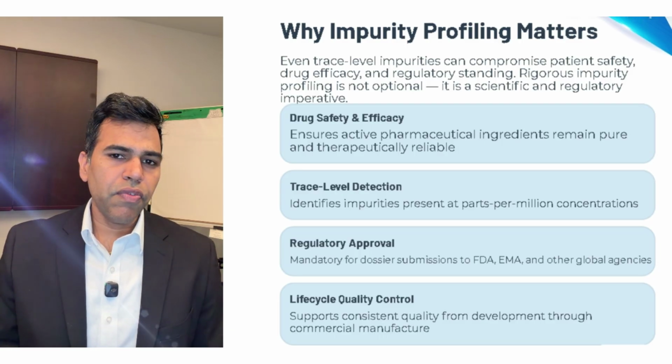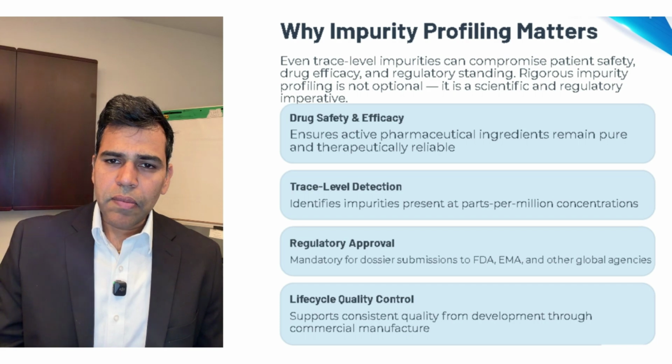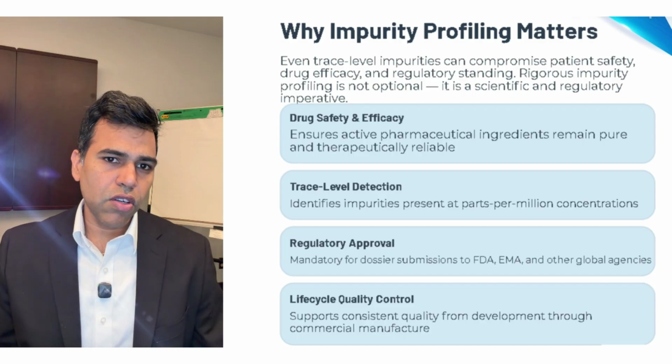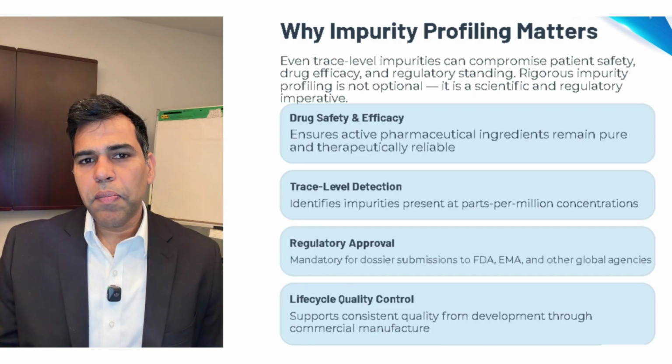Why impurity profiling matters? Let's start with the why. Because if you are in pharma, you already know impurity profiling isn't optional. It's a scientific and regulatory imperative.